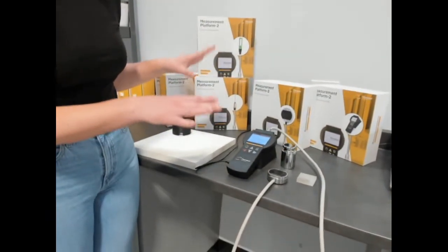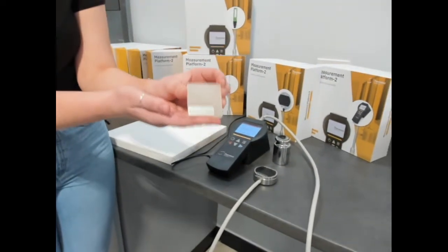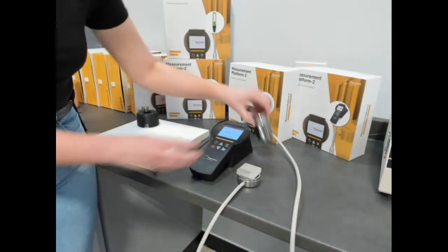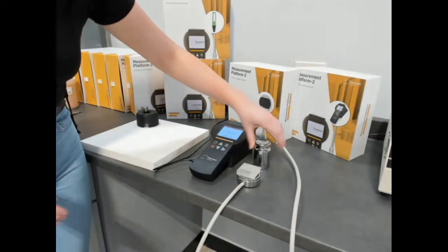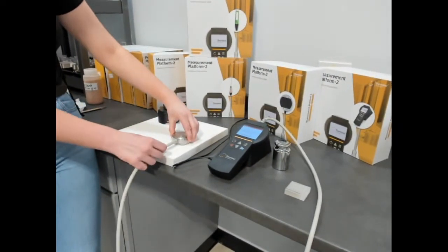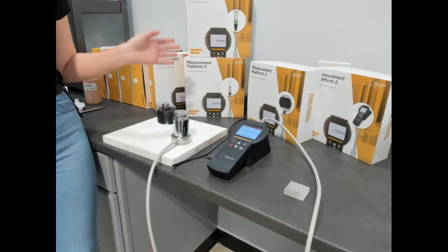To set up a measurement with the single-sided TPS4 sensor, you only need a single piece of sample. Place it on top of the TPS4 sensor with the provided one kilogram weight to achieve good contact between the sample and the sensor. If you have a larger sample, you can also place the sensor upside down on top of your sample with the one kilogram weight and perform your measurements that way.